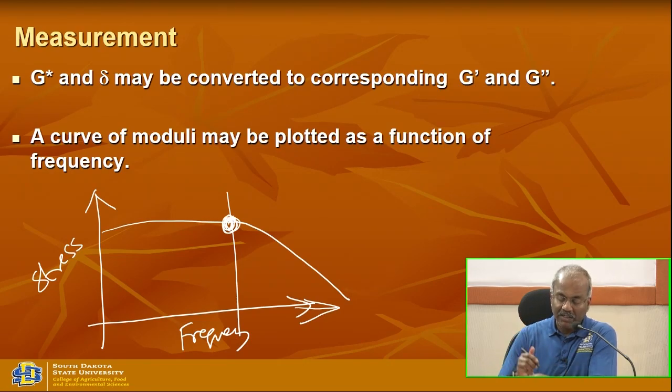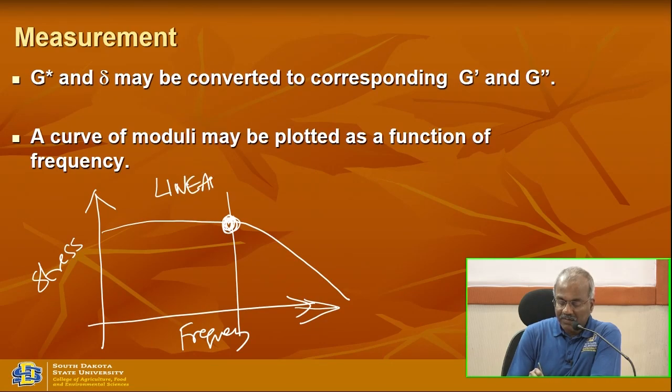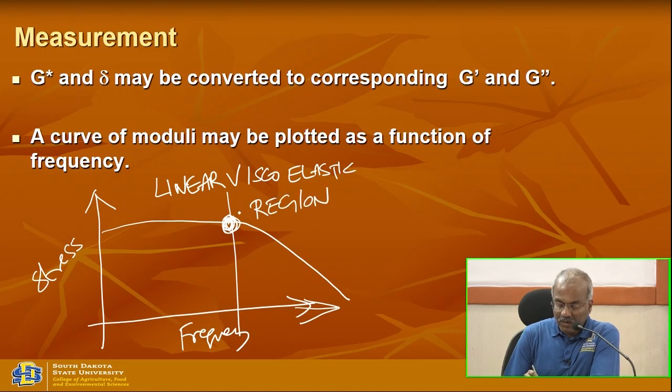So the important point is, you need to identify the linear viscoelastic region. You can work on this stress. Once you identify this stress, use this stress in your future tests. That way you get accurate results. If you don't do the test and randomly select your stress, that will not be the right way to do it.